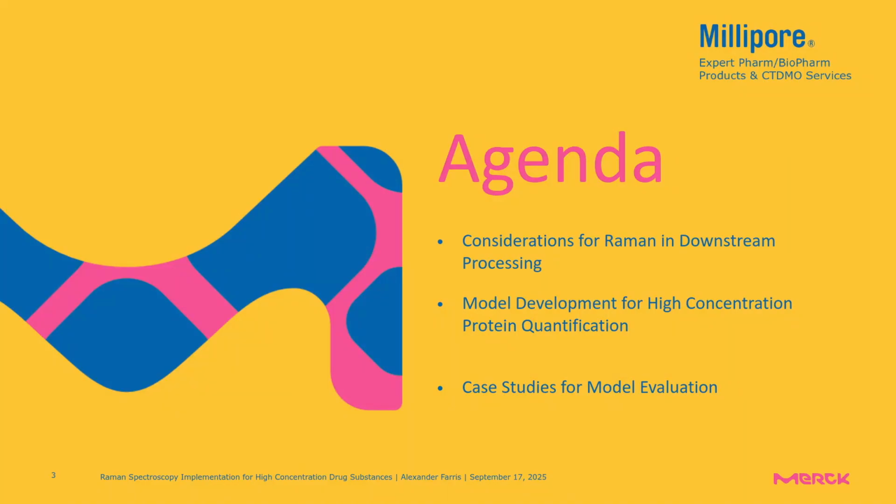So the agenda for this topic will start with considerations for inline Raman spectroscopy in downstream processing. Then we will move into the model development workflow for concentrated protein quantification. And then finally, we'll look at a couple of case studies that display the capabilities of the developed models.